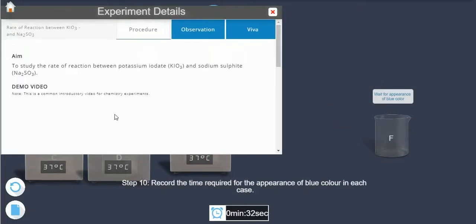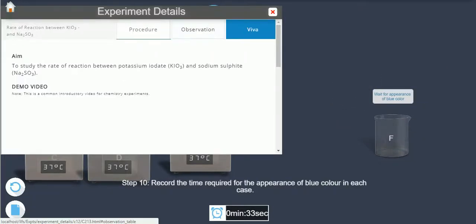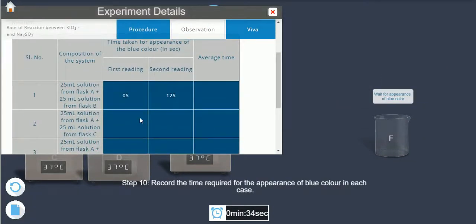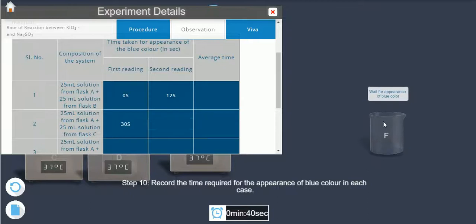Step 10: Note the initial time required for the appearance of blue color in each case.